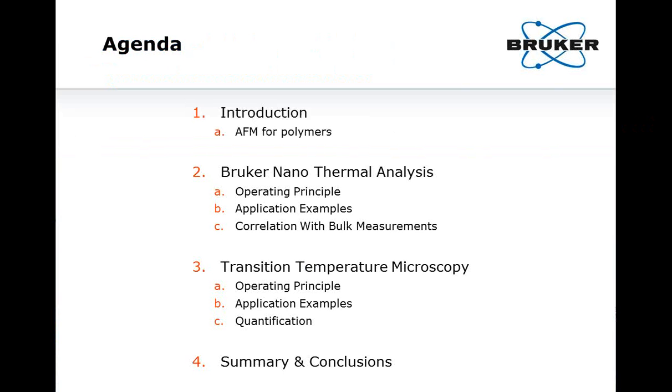So in this presentation today, first I'll give a very brief introduction about the role AFMs can play in polymer characterization and where nanoscale thermal analysis can come in. Then secondly, I'll give a deeper dive into our nanoscale thermal analysis, how it works, and a number of application examples showing its benefits and the breadth of the applicability. And in the third part of the presentation, I'll really then focus on the new capability, the transition temperature microscopy, how it works and what it can provide in addition, before I finally summarize and then get to your questions.